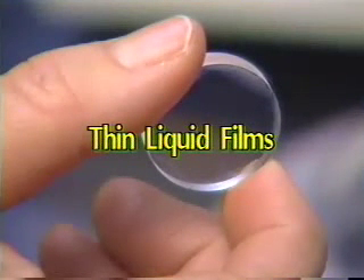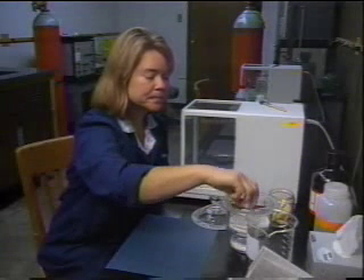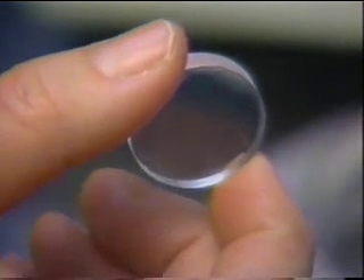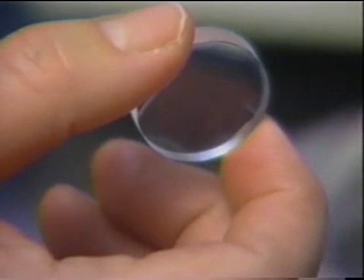Part 1: Thin Liquid Films. This demonstration will begin with thin films which are run on salt plates. The plates we use are made of NaCl, common table salt, which has been pressed mechanically to form a large crystal.